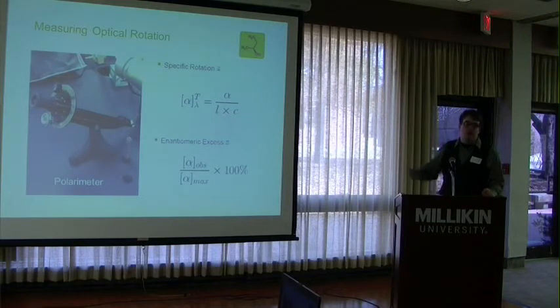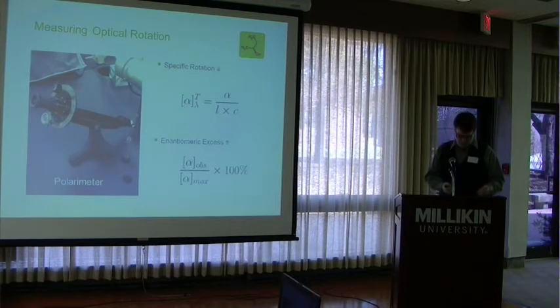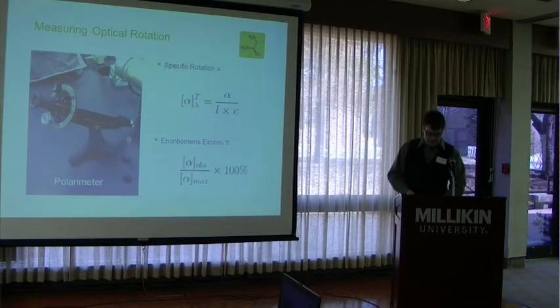But since we know the literature value for that specific rotation, we're able to measure our enantiomeric excess, or how pure our one enantiomer solution is.